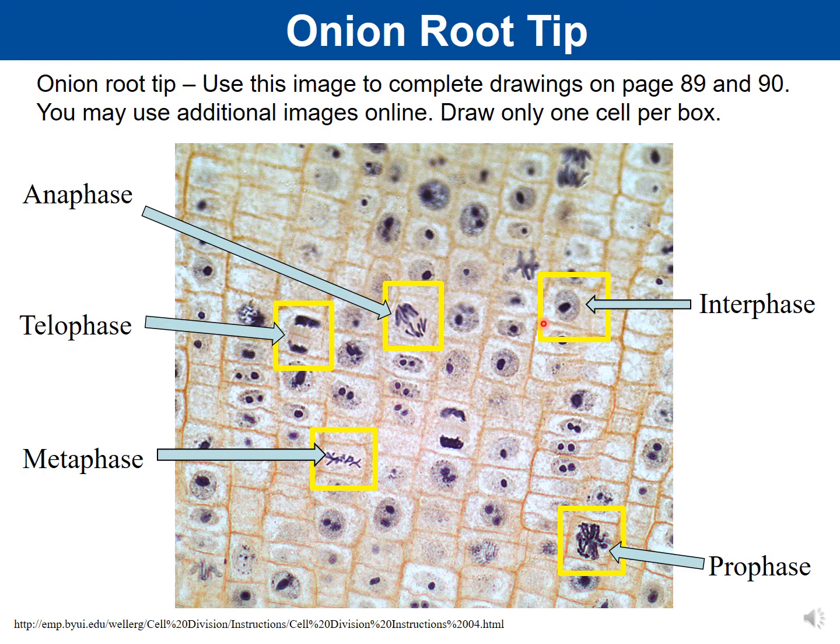Remember that you cannot distinguish them at this point. The purple circle here is the nucleus, which means that the cytoplasm is the space outside of this light purple, but inside the cell wall. This little circle here is going to be our nucleus. The darker purple dot is going to be the nucleolus, and that would be our cell in interphase.